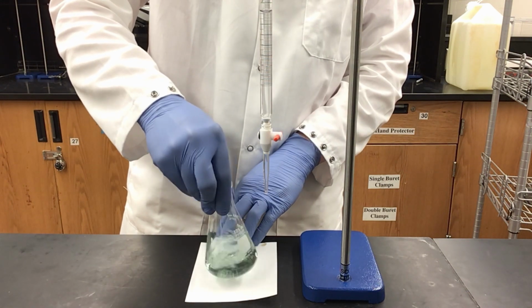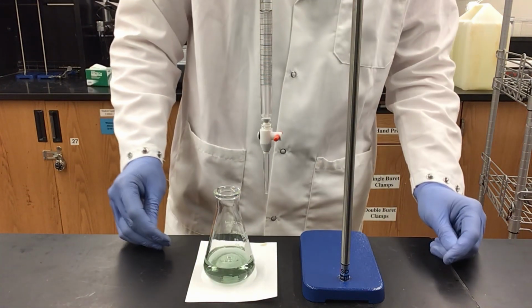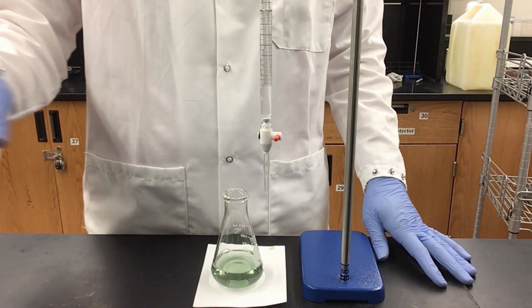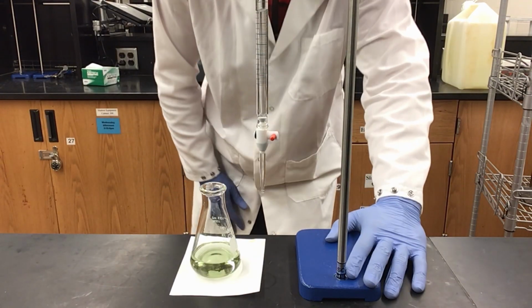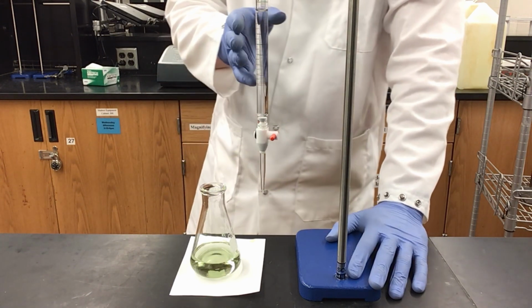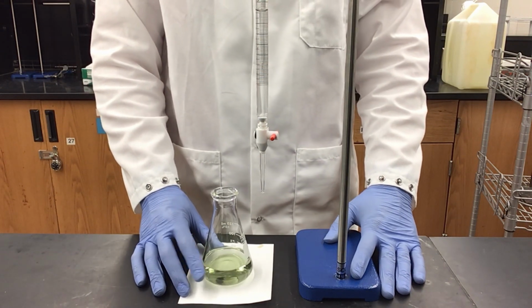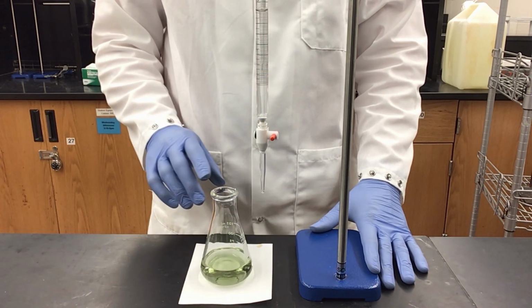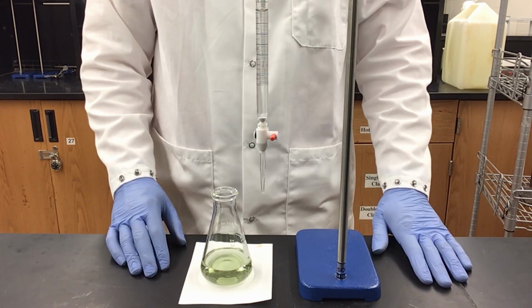And there we go. I have now reached my endpoint. I'm at my light green indicator color, so I can stop and record the amount of sodium hydroxide I used for titration. I checked and I used 42.9 milliliters of sodium hydroxide, and upon double checking, I've confirmed I've used 42.9 milliliters of my standardized sodium hydroxide solution in order to titrate my roughly 5% vinegar solution.